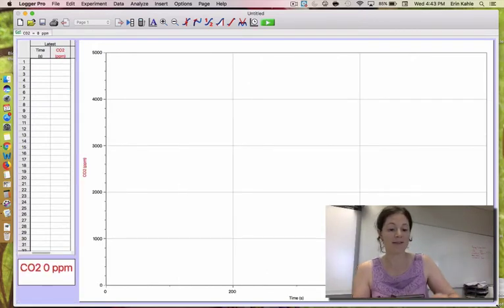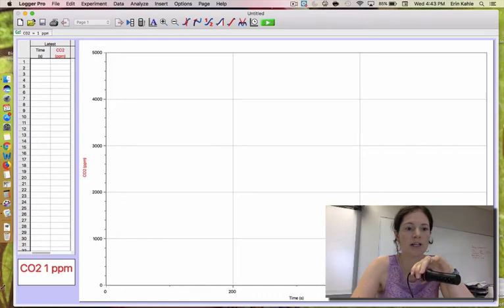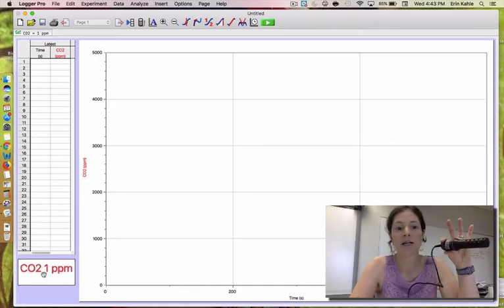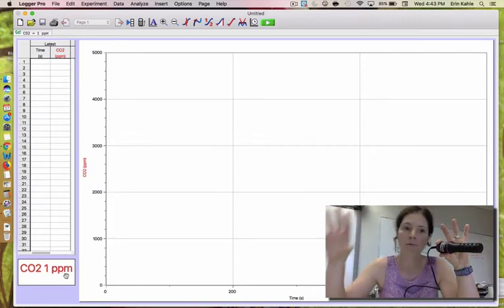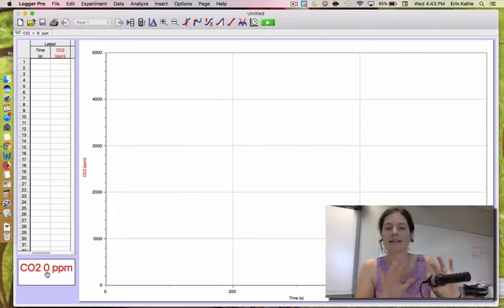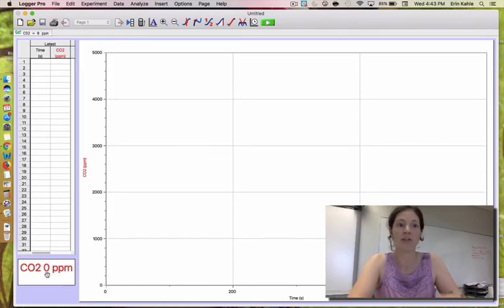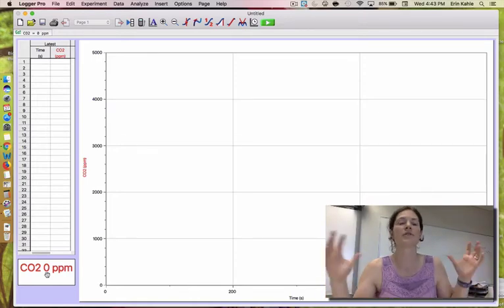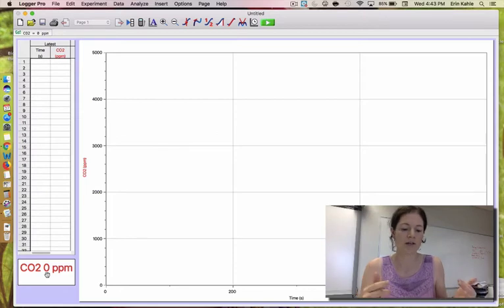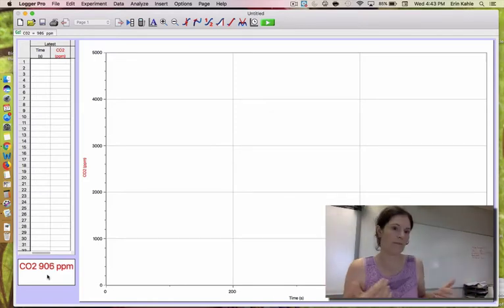So I'm going to demo the beans, and when you first hook up the CO2 probe, you can see down in the corner that it's measuring parts per million, so of a million particles in the air, how many are CO2. It's saying between 0 and 1. It takes a bit of time to set up. Sometimes they come on and say like 50. The parts per million in regular air is probably something like 400, 500, 700, and maybe higher if there's a ton of people in the room. So you're just going to let it warm up until it gets to something around 400. We'll see, yeah, 900 after a day of kids being in the room makes sense.